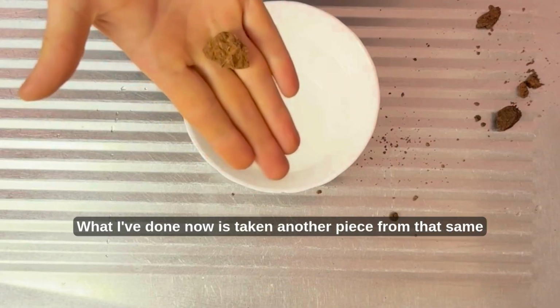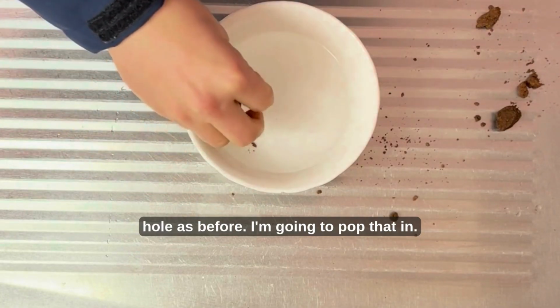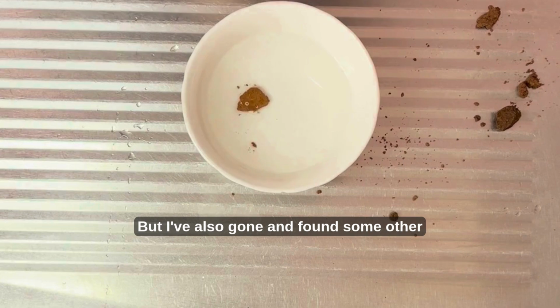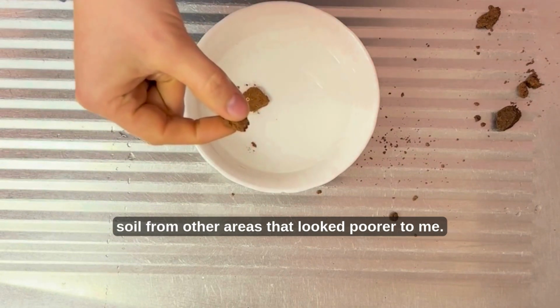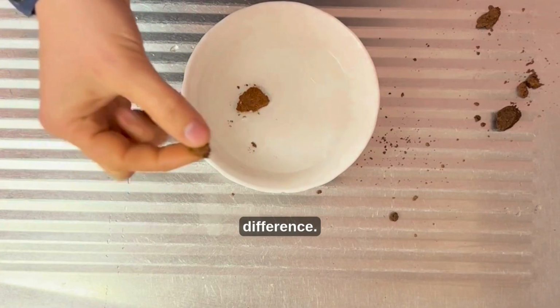Fantastic. What I've done now is taken another piece from that same hole as before. I'm going to pop that in. But I've also gone and found some other soil from other areas that looked poorer to me. And hopefully this might show a little bit of difference.